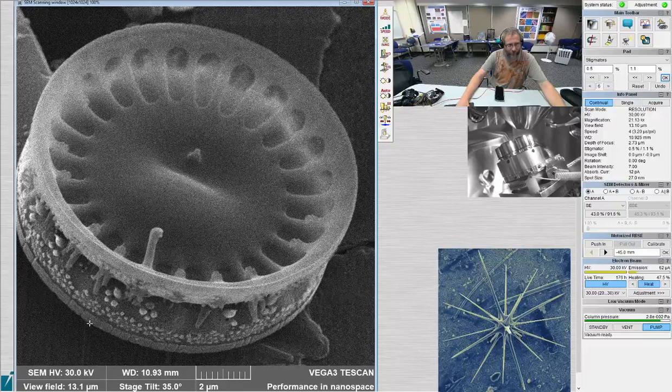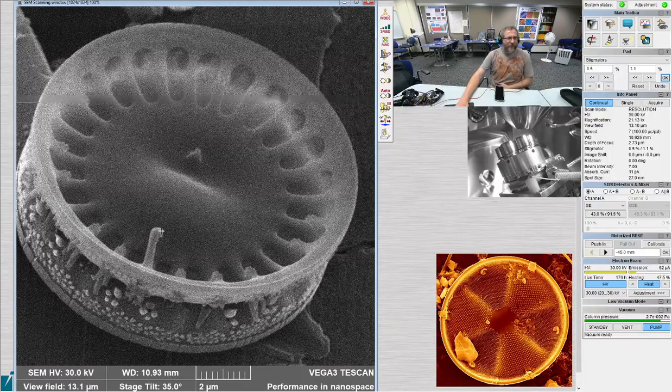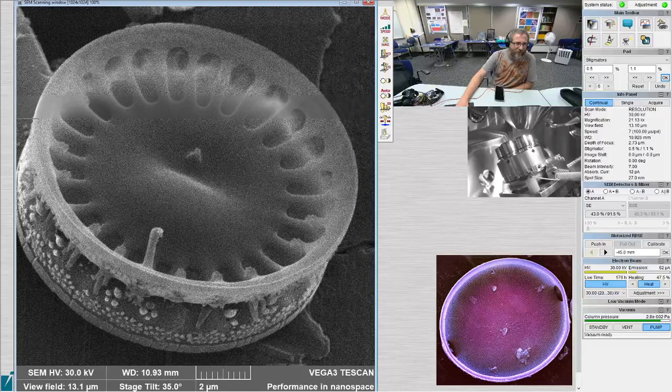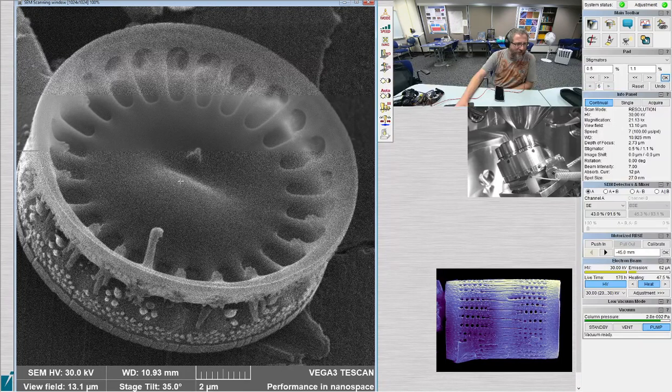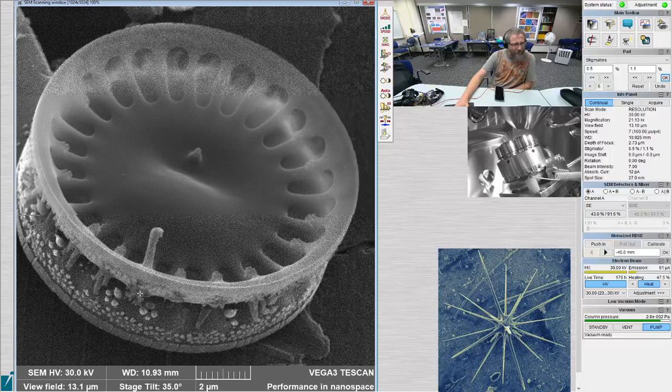They have a lot of spines. There's a lot of spine action going on down here. Yeah, I think we got a really oddball Metagenianna. Oh, what? Are those spines in sets of three? There are definitely a lot of spines coming out in one little area here. I don't know what's going on here. I'm hoping it becomes clearer when the beam gets down there. What the heck? It's a freak show.